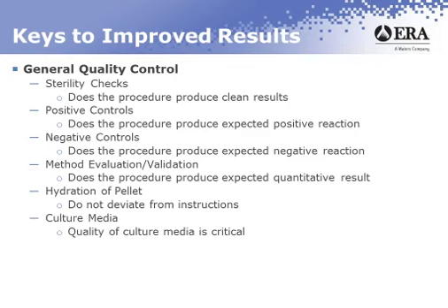Okay. Culture media. The quality of the media when it comes to getting the right answer on the sample is probably one of the most critical aspects of getting the PT or QC to work out. You should never prepare your media from raw ingredients if a source of dehydrated media is available. If you're preparing it from dehydrated media, follow the instructions closely. Critical aspect: if you're told to check the pH, you really need to check the pH and make any adjustments. Organisms are very finicky when it comes to pH. You want to make sure that you're checking it.